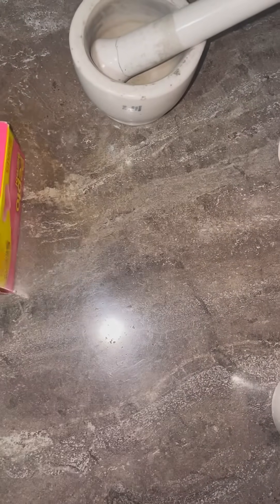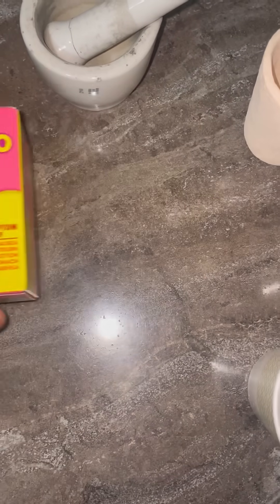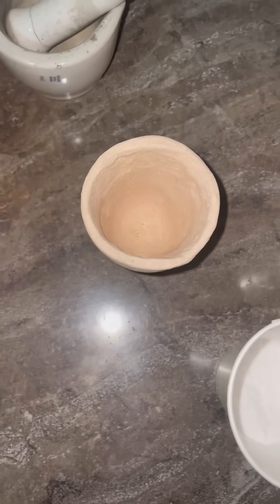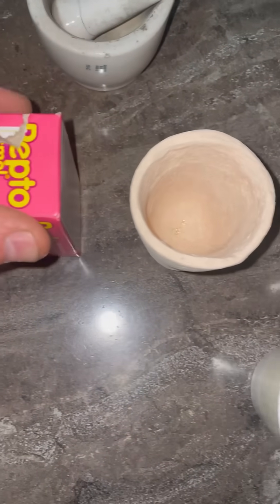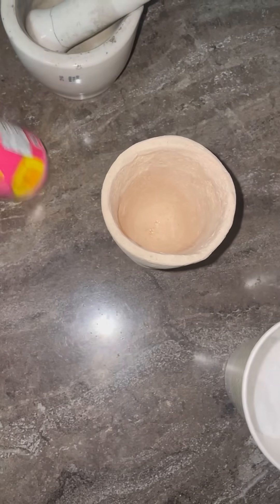Hi everyone, Cody here. I got the idea to use Pepto-Bismol instead of lead for a fire assay, so let's grind up some of these pills and see if this will actually work.